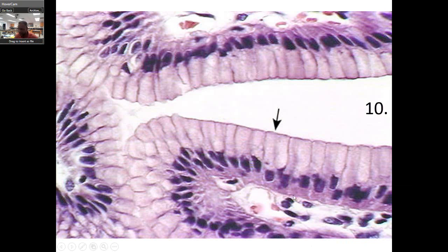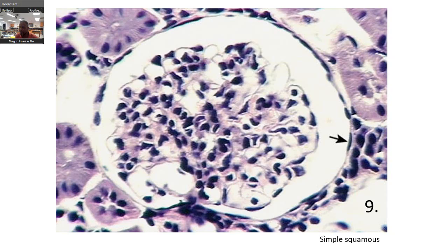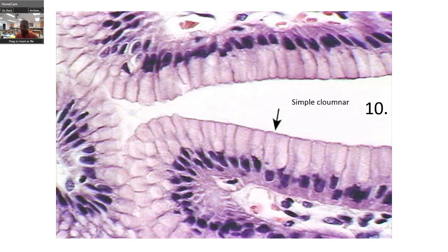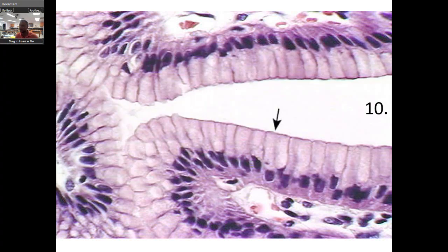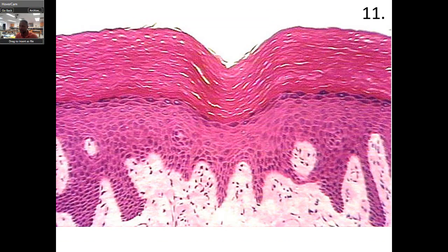Now take a look at this. See the nuclei — uniform. You don't see any cilia coming out. What do you think it is? That is simple columnar. Here's the apical surface, lumen, and basement membrane. This down here is actually connective tissue.